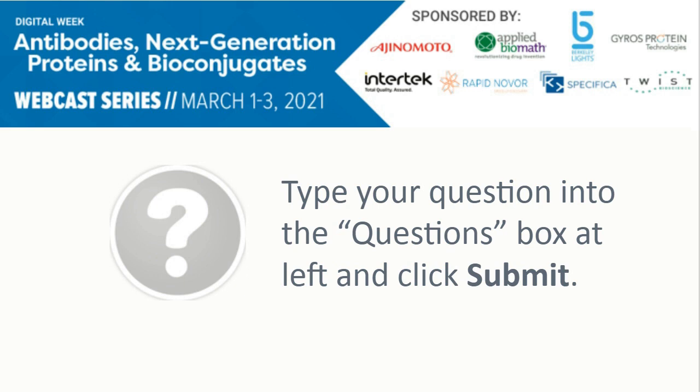Yeah, great question. We have already done the workflow and enriched for peptides as well as soluble proteins and domains within soluble proteins. Like I said, we've done a couple of COVID projects. Of particular note is that we are trying to find high neutralizing antibody binders against the RBD, the receptor binding domain of the spike protein, right?